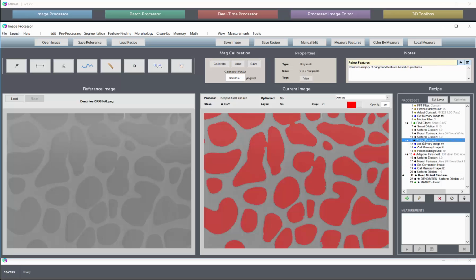steps that we might want to adjust in the case of a recipe not performing optimally, and the notes can tell us how we might want to adjust them, or at least give us some insight into the user's mind behind why that step is there. Obviously, a flagged step doesn't have to have notes, and a noted step doesn't have to be flagged. Those are two independent controls that you now have over annotating a particular recipe.